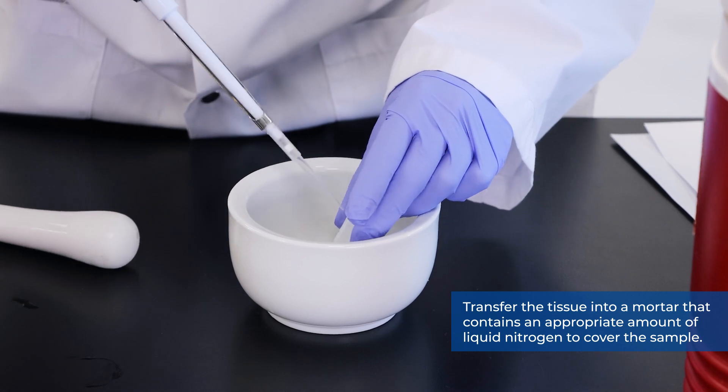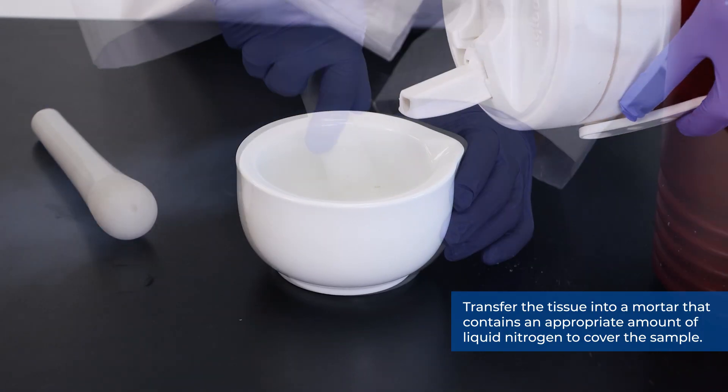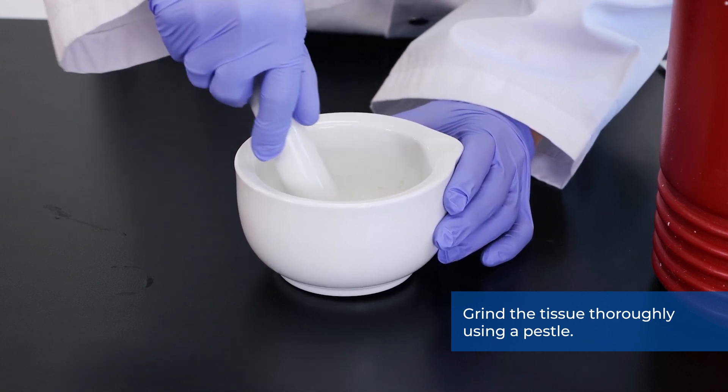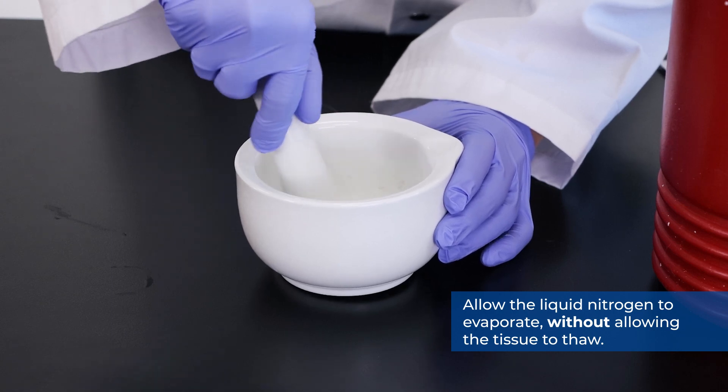Transfer the tissue into a mortar that contains an appropriate amount of liquid nitrogen to cover the sample. Grind the tissue thoroughly using a pestle. Allow the liquid nitrogen to evaporate without allowing the tissue to thaw.